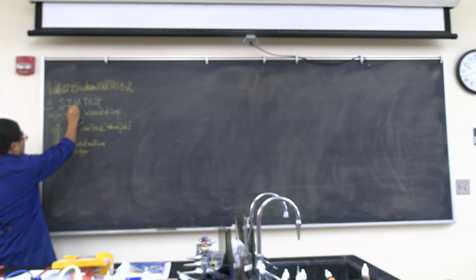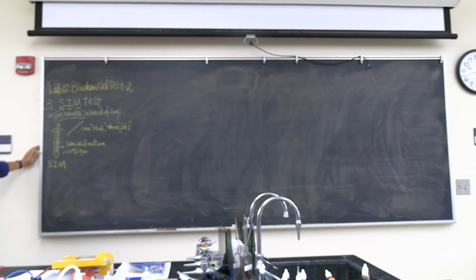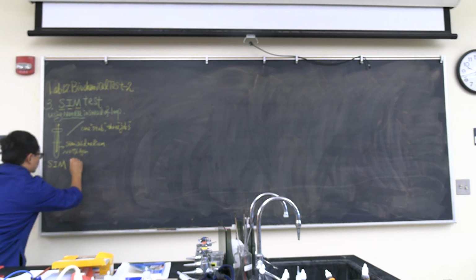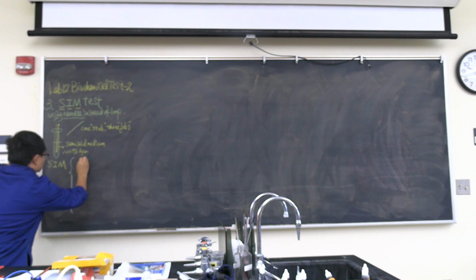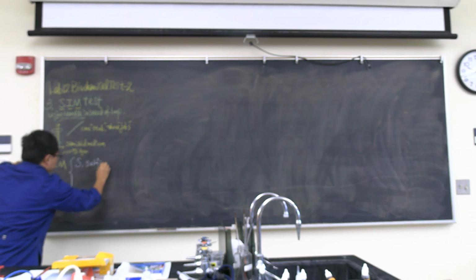3 jobs. So what are the 3 jobs? Corresponding to SIM, each letter of the SIM test represents an index. S means sulfide.